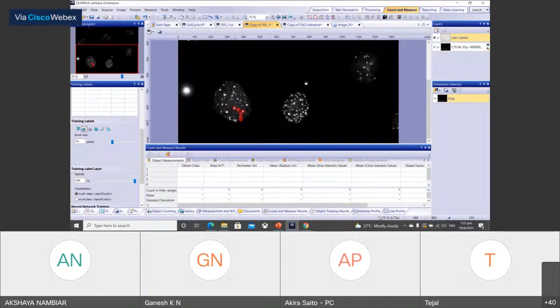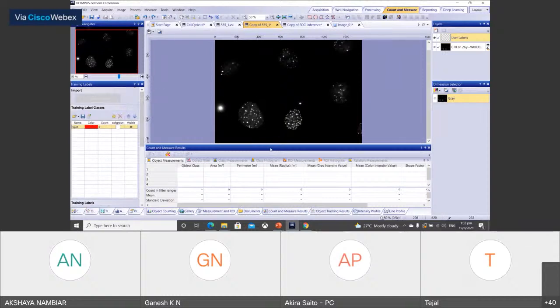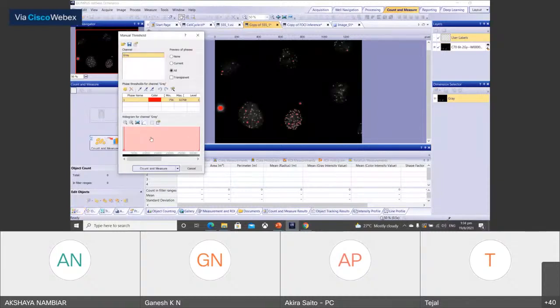spot by manual handwriting. It is also possible, but I would recommend using our count measure to identify each spot and then make some adjustment manually. How to do it: go back to the count measure and adjust the thresholding.